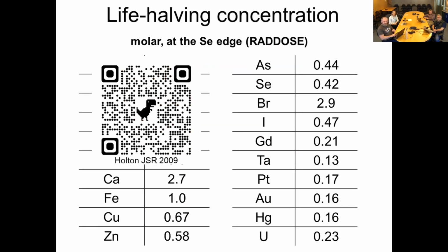So this is the QR code to a paper that describes this, but this is the most common kind of mistake people make when they have especially sensitive crystals: they accidentally put in a heavy atom. Iodine is a common one, where you, let's say, put in 4 molar sodium iodide. Damage doubles every half molar, so that means your crystals aren't going to live very long. And so this is something really good to bear in mind, sending your crystals to any synchrotron.